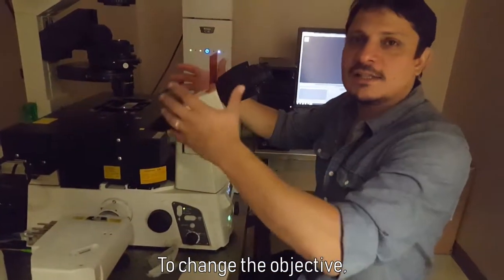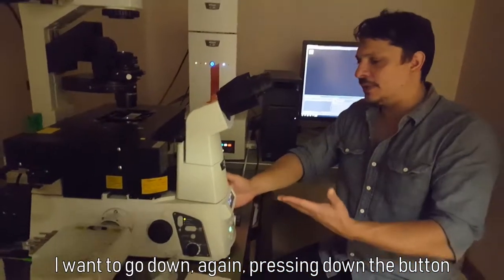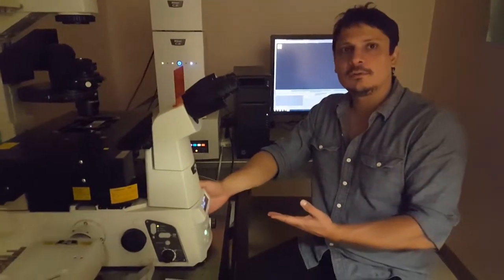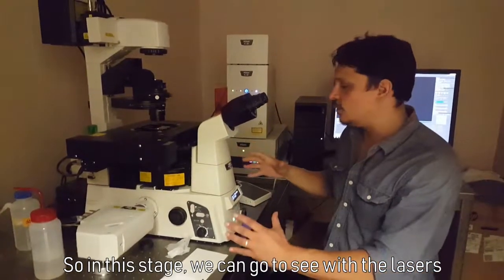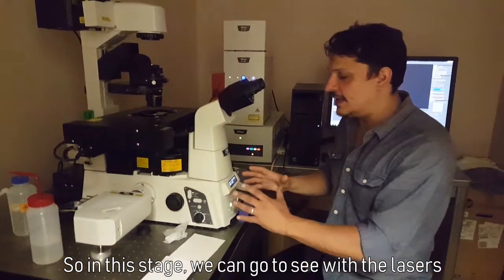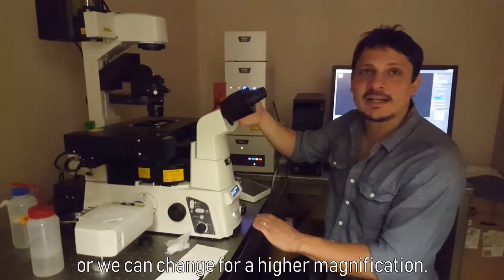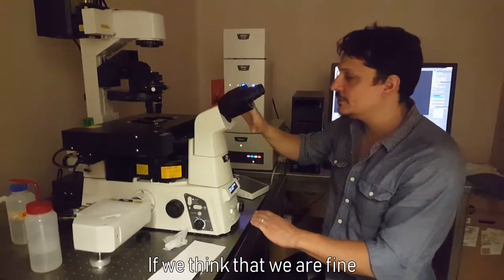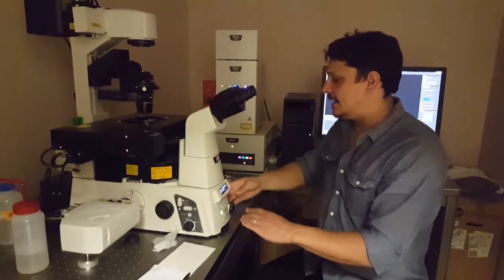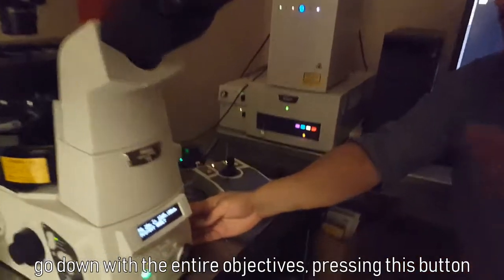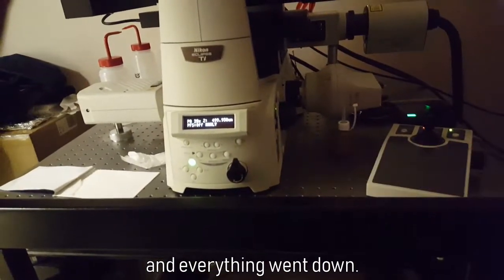To change the objective, I want to go down again, pressing down the button. So in this stage, we can go to see with the lasers and see if we have fluorescence, or we can change for a higher magnification. If we think that we are fine in the place that we want to focus, we can go down with the entire objectives, pressing this button, and everything went down.